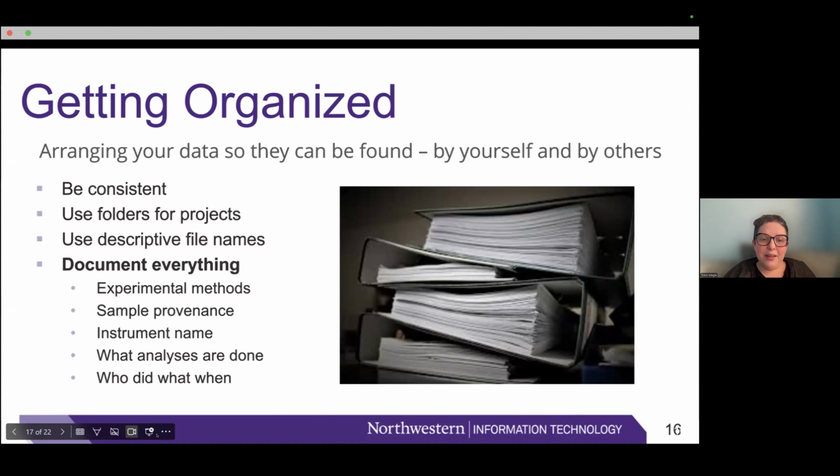Write it down. So things like, what experimental methods did you use to create a sample? Where did the sample come from if you got it from someone else's experiment? If you run the sample on a microscope, what was the instrument name, just in case there's something wrong with the instrument and you need to identify samples that you might need to rerun? And then after you have the data, what type of analysis are you going to do with it? And also, if you're working in a group of people on the same project, who did what when, so that you can backtrack if something goes wrong.